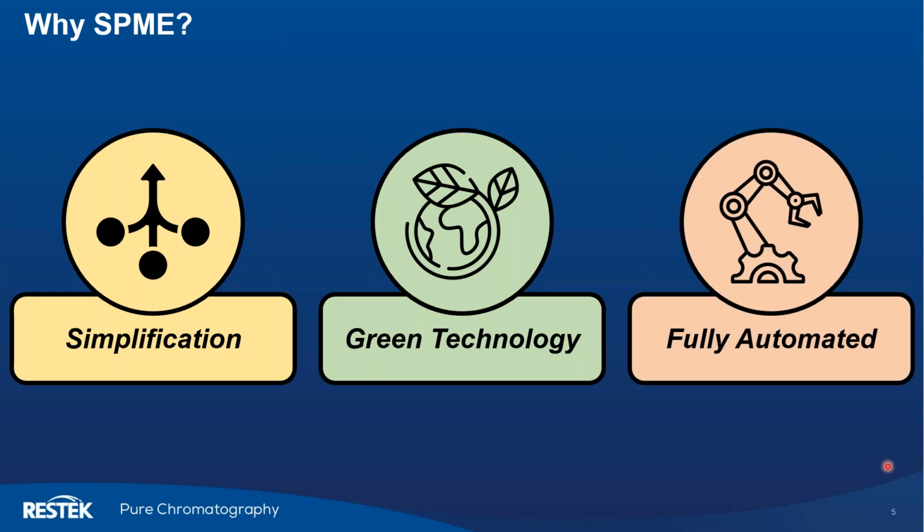And then finally, as I mentioned, another reason why you would want to pursue SPME is that it can be fully automated on your instrument top, giving you much better throughput, and fully automating SPME will also make your methods much more reproducible compared to manual mode.